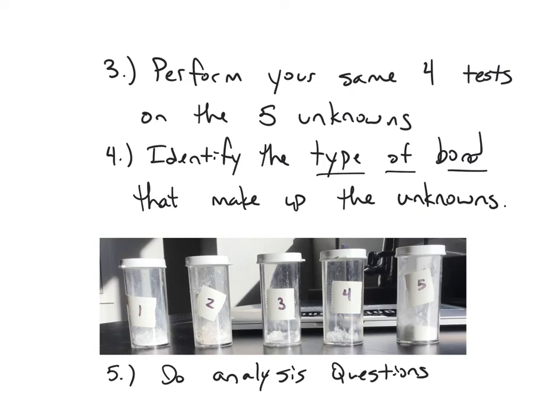There are a list of things that you can use to perform your tests with, and so doing a little bit of work ahead of time and doing the pre-lab will help guide you to determine what type of tests you want to perform. And the last thing I want to say is that if there's any test that you want to perform on your knowns or your unknowns and you don't have the materials to do it, ask your teacher, me, and I'll let you know if we can come up with that or not. Or if there's a particular technique that you want to try but you don't quite know how to do it, I'd be more than happy to try and brainstorm an idea out with you. But just come find me and I'd be happy to help.